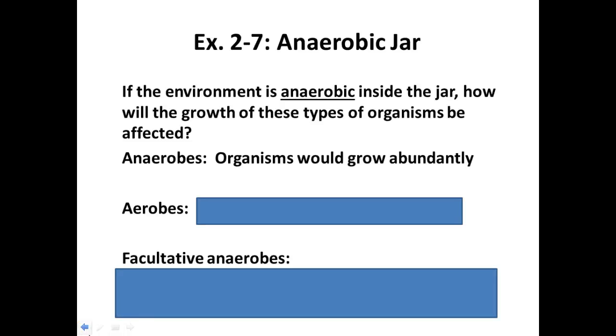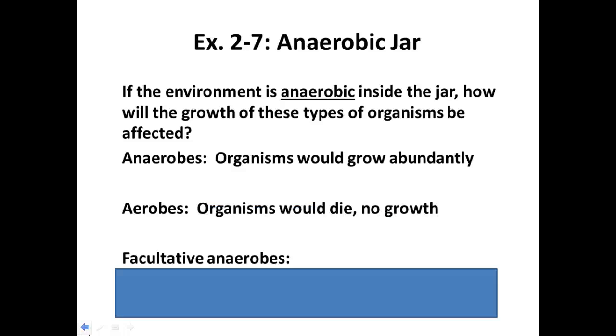If you stuck an aerobe in there, though, and then put these gas packs in there and you generate an anaerobic environment, what are you going to do to these poor aerobes? You're going to suffocate them. You're going to kill them. They're going to die. There's going to be no growth when you open up that jar later if you maintain an anaerobic environment. Now your facultative anaerobes.